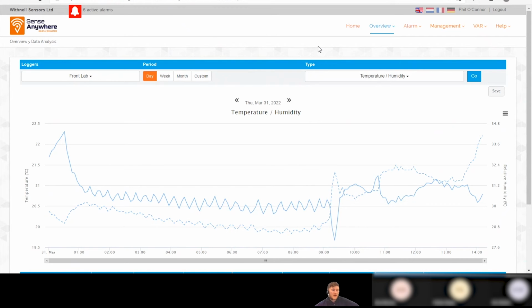Whether it would be a good idea to keep stopping and starting, like I say, it will save battery. So if you know you've got a 6 month period where these loggers aren't going to be logging, then if you wanted to preserve a bit of battery, you can just put them in rest mode, as it were. And then as soon as you're ready to use them again, you basically take the logger from the cradle, leave it out for 10 minutes, and then plug it back in.